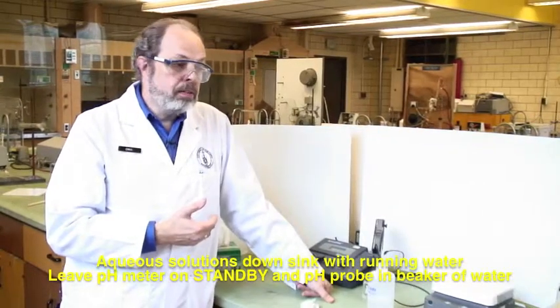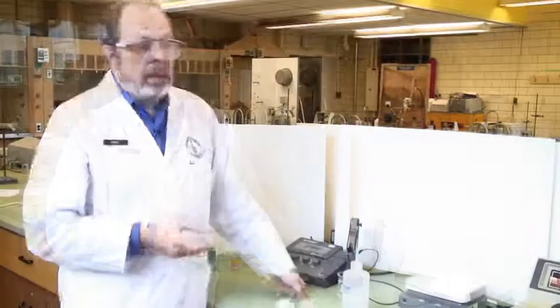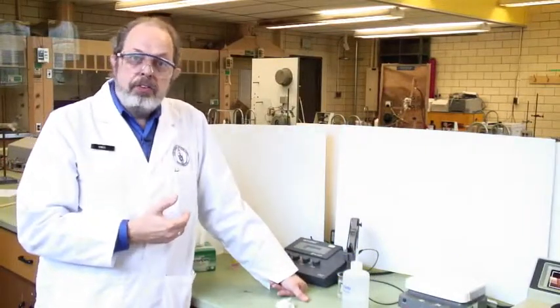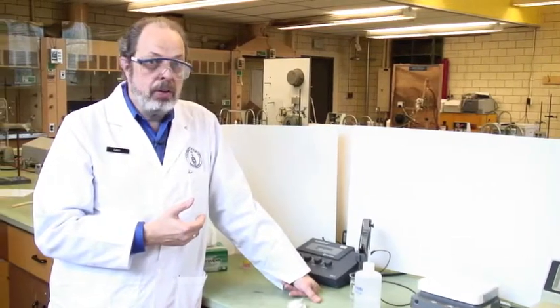The waste disposal for this is down the sink with lots of running water. And that should be enough for you to be able to perform experiments, either Q3 or Q4.